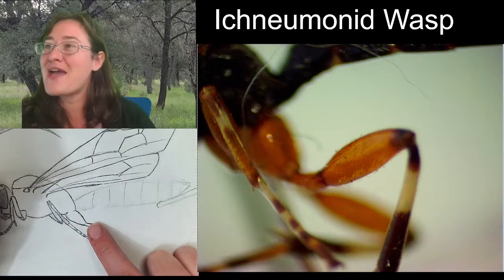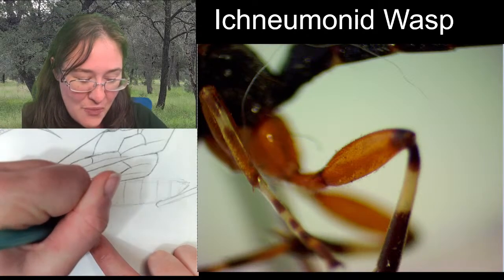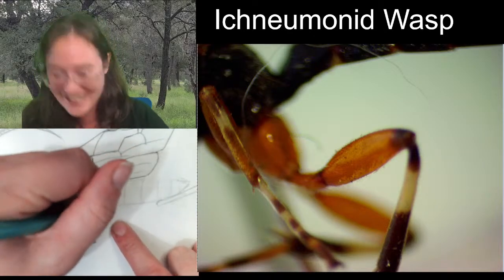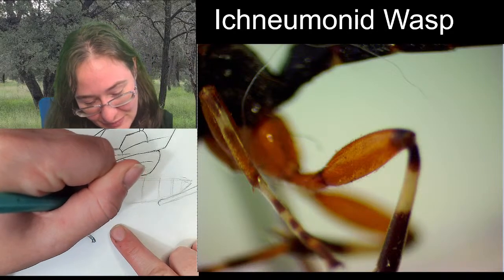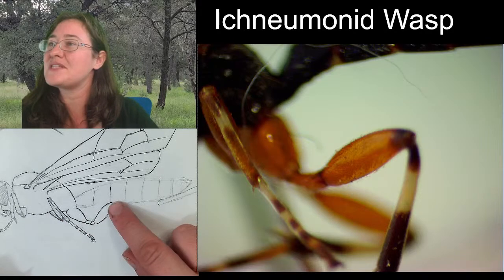And we've made all of the jokes about the fact that our wasp seems to work out. She works out. She's got strong femurs. So that's nice and bulbous. It's bulbous here, bulbous there.